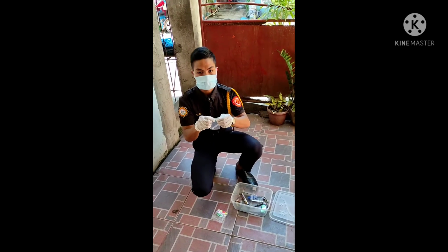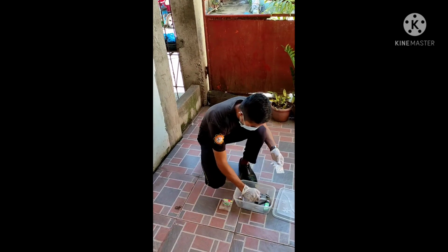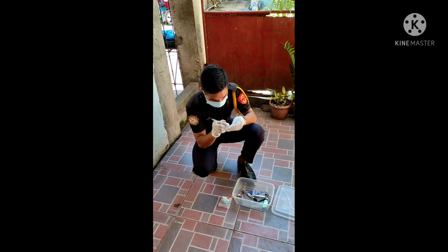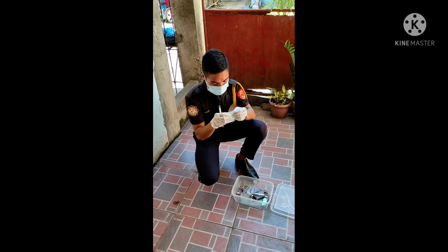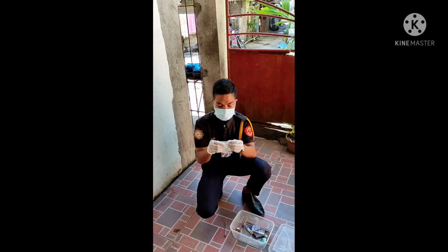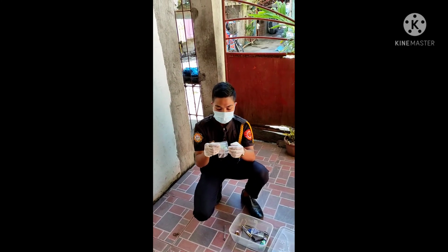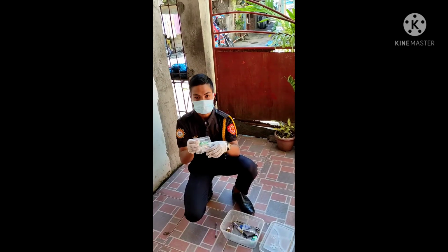Then the next, I'm going to label this stain. The purpose is to preserve it, so that it will not be mixed with other substances.